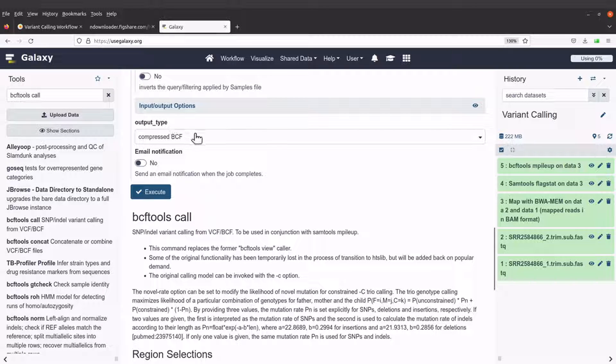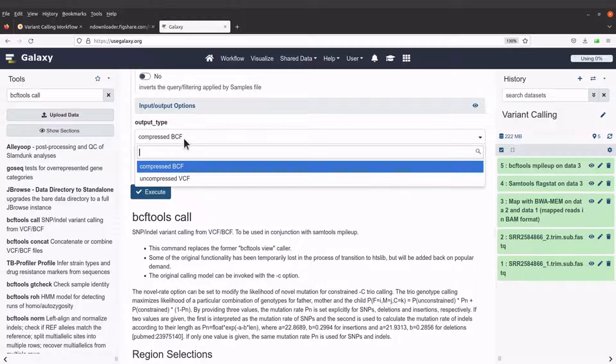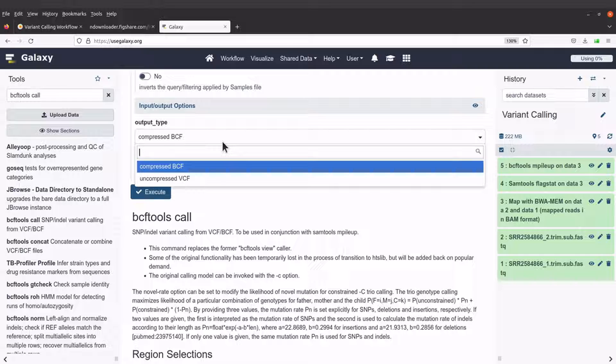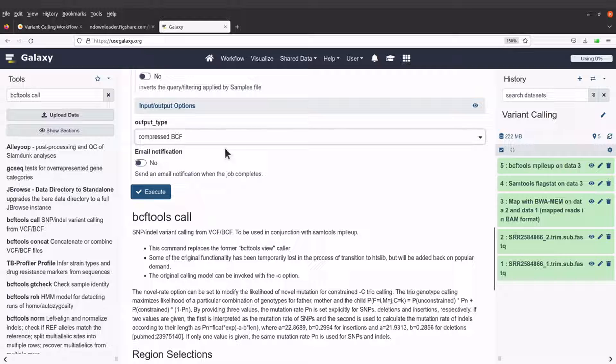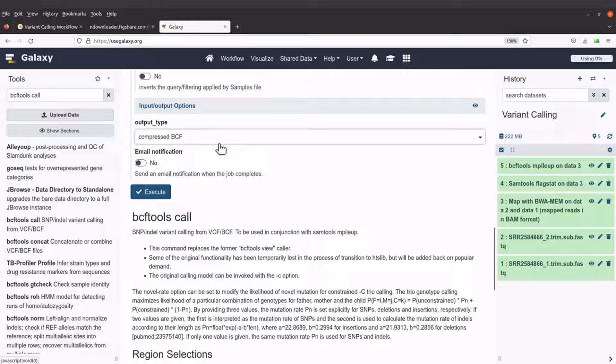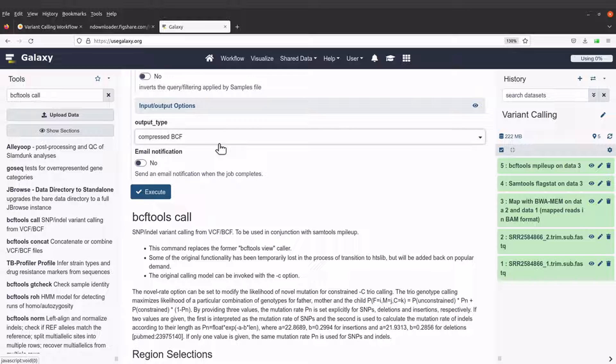The output type, you have compressed BCF, you also have uncompressed VCF. So the output type, if you specify compressed BCF, then when you are done, you have to convert it to a VCF format so that you can use it.